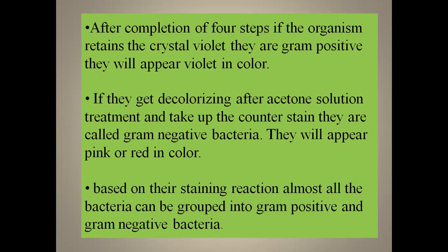But while you are adding the acetone or ethyl alcohol as the decolorizer, it will lose the stain. And then once again, what is the next stain we are adding? We are adding the secondary stain or counterstain, that is the safranin or the carbol fuchsin. They will take up this safranin or carbol fuchsin and appear as pink or red in color.